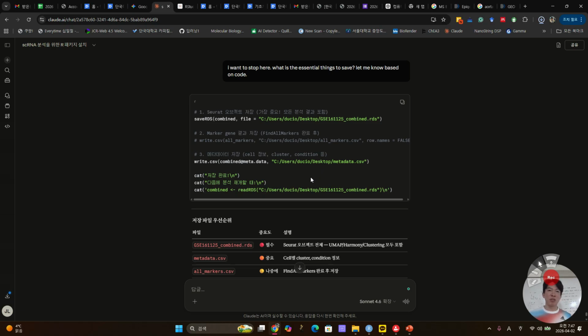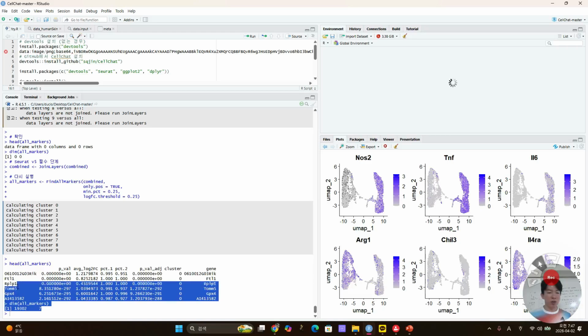Maybe, but it's very important. So maybe this time you are analyzing for a few hours, and then you don't need to take another few hours for analyzing again. So, or some CSV file for knowing gene set or biological process or data, and then next time you automatically analyze it.